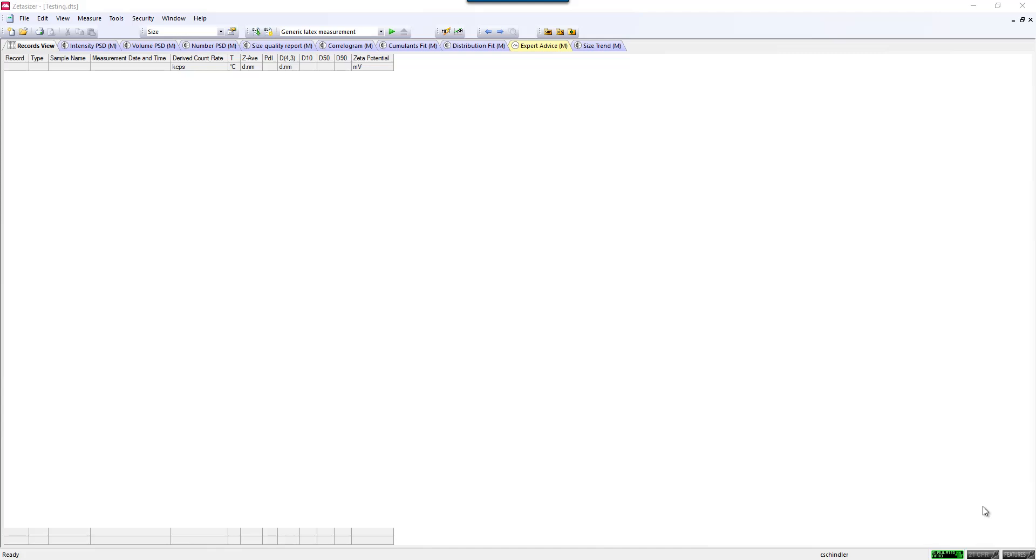This is a video showing how a simple sizing measurement can be made in the Zetasizer NanoSeries software. Everything in software runs on Standard Operating Procedures, or SOPs. These can be written into the software and saved and reopened later by a user.